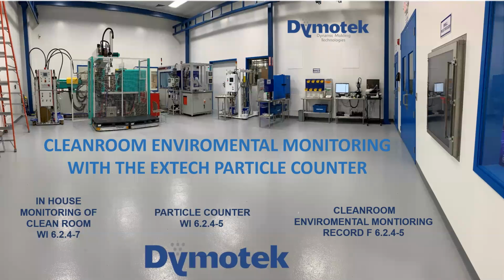In this video training, we'll be covering the cleanroom environmental monitoring with the Extech particle counter, the in-house monitoring of the cleanroom work instruction 6.2.4-7, the particle counter work instruction 6.2.4-5, and the cleanroom environmental monitoring record 6.2.4-5.